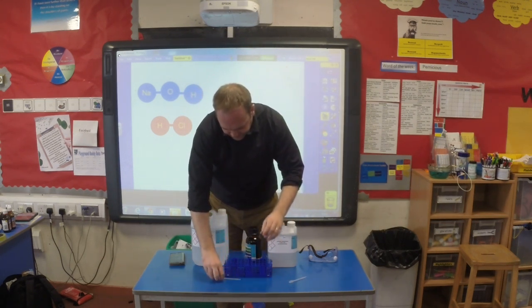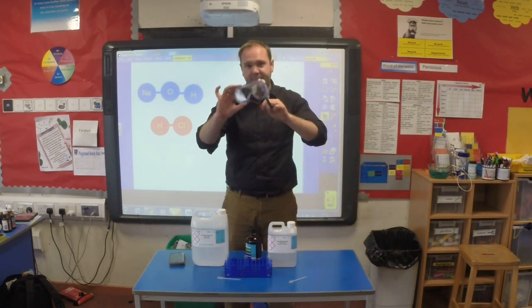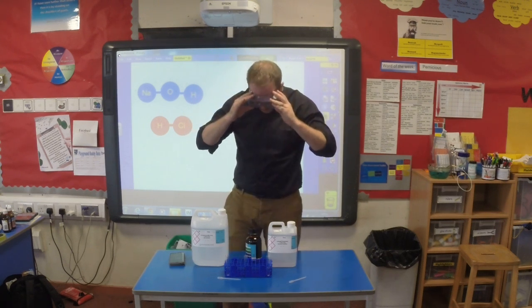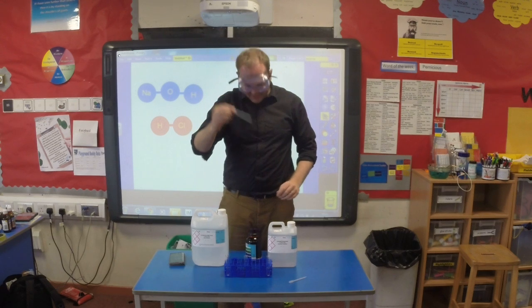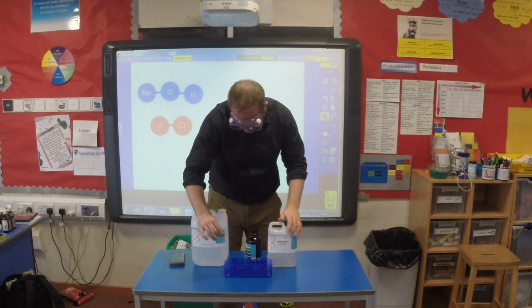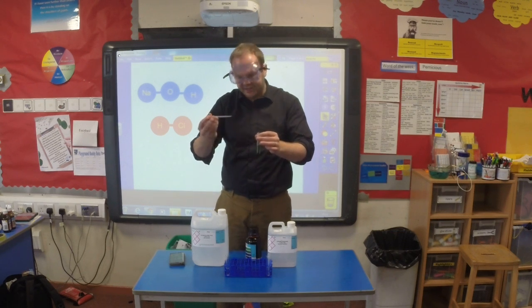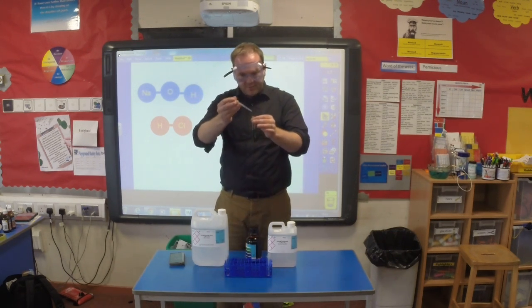For instance, I actually have my eye protection on at this point already. Insist upon eye protection. You cannot do this without eye protection. But what you can do at this point is they get two pipettes, one for one test tube, one for the other test tube. Not technically pipettes, just droppers. They're going to start off by just doing a single drop. So this is where you can insist upon correct procedure. I want them being very methodical with this.